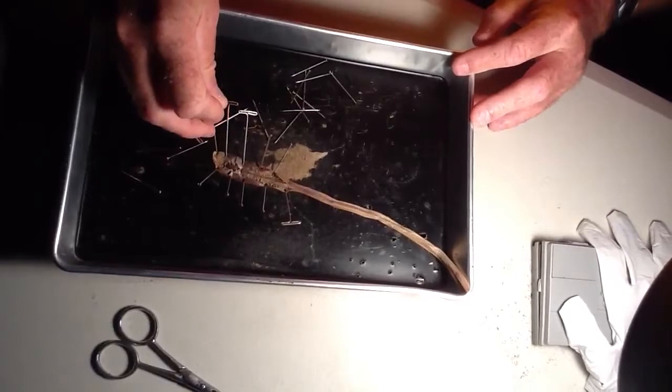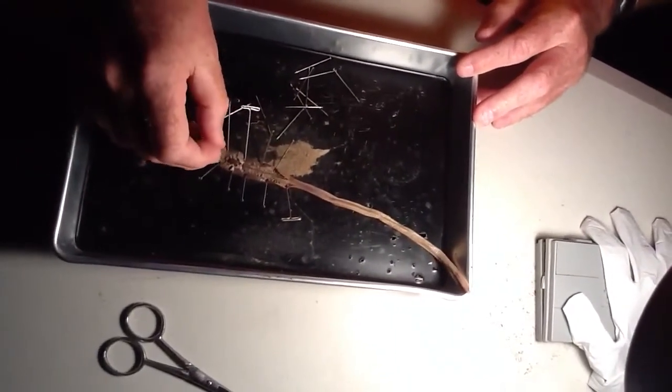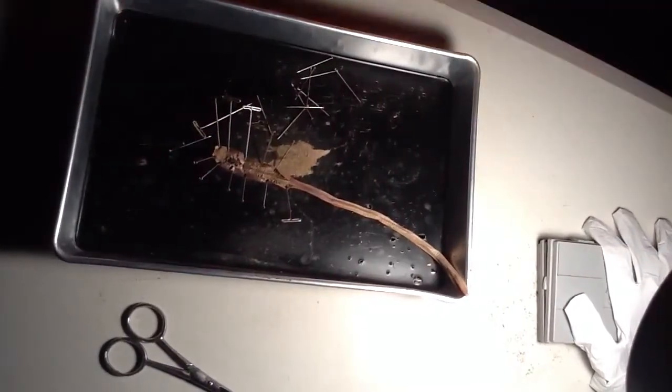I could probably open up the mouth area a little bit more to see the pharynx. And that's a dissected earthworm. Does that make sense to everybody? Can you handle that? All right.